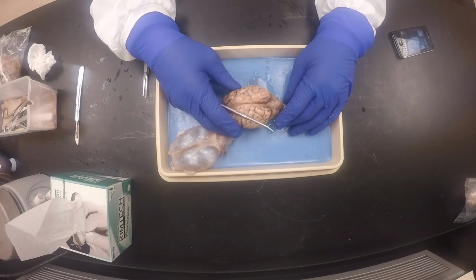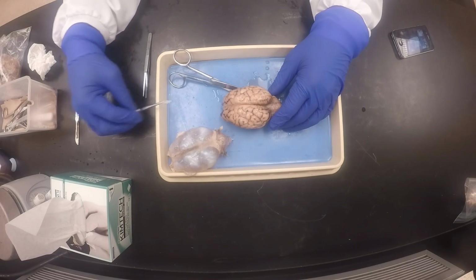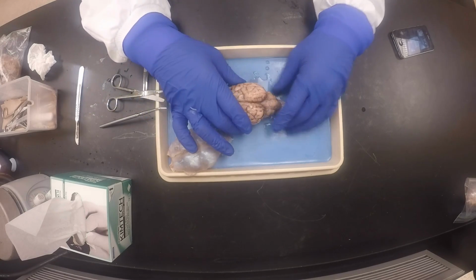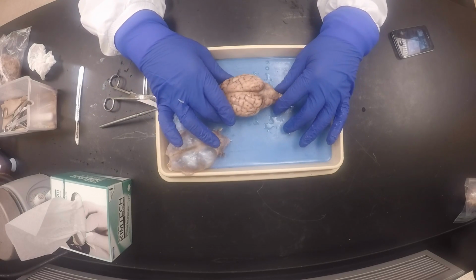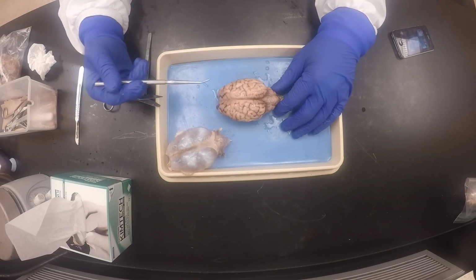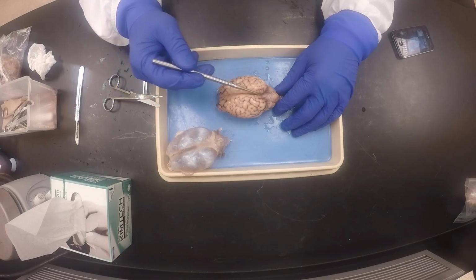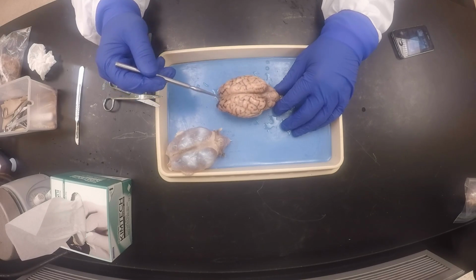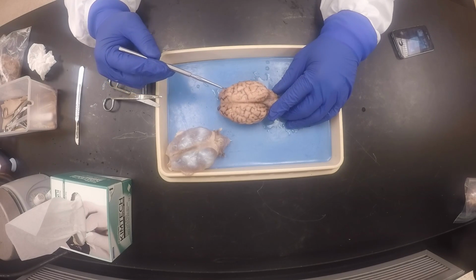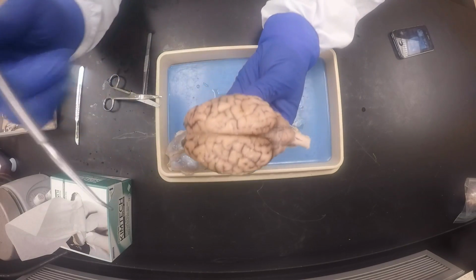Okay, I should have gotten my oil. So what I'm going to do is identify the other parts on the superior part of the brain. So this is the cerebral fissure, or the longitudinal fissure. And the bumps are the gyri, or gyrus singular, and these are the lines. Okay, so I'll put it up close.